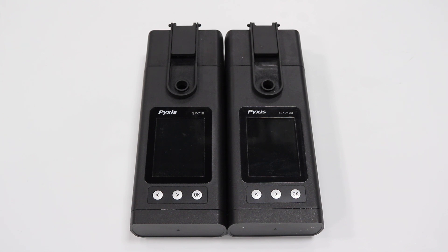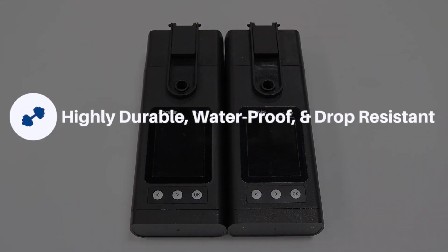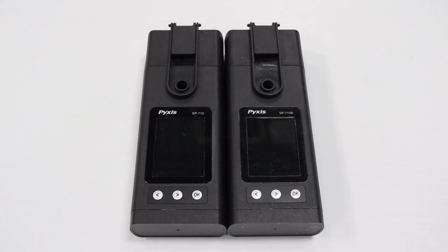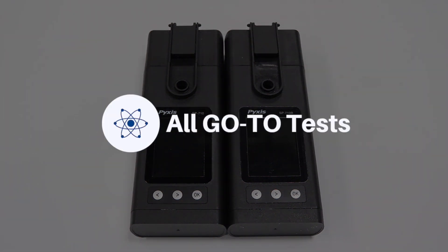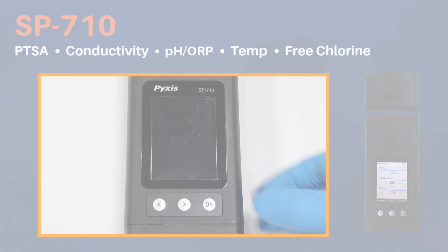With a water treatment professional in mind, the new SP-710 series offers a military-grade design in a highly durable, waterproof, and drop-resistant platform with a wireless pH/ORP module for simple in-the-field swap-out. The SP-710 series' unique layout allows the water treatment professional to have all the primary go-to tests for cooling water and boiler applications in one device with the confidence of having accurate results in real-world challenged waters.